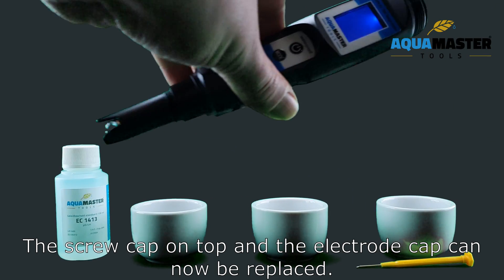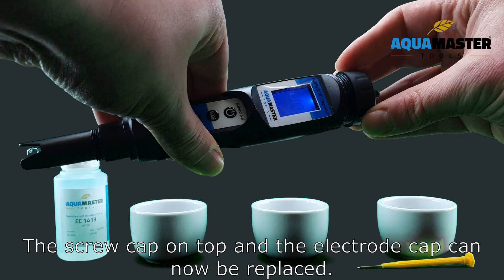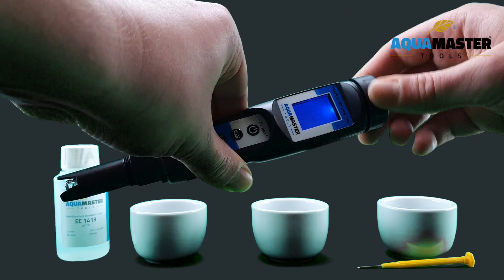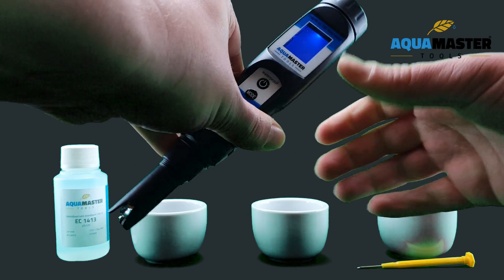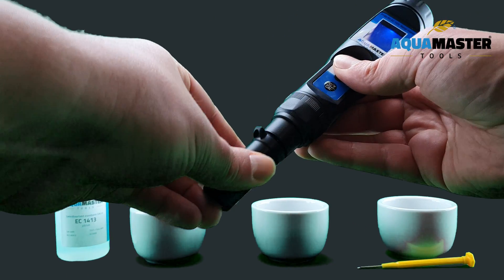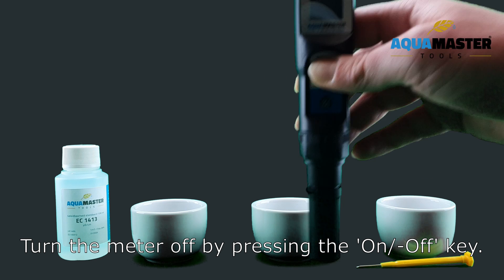The screw cap on top and the electrode cap can now be replaced. Turn the meter off by pressing the on-off key.